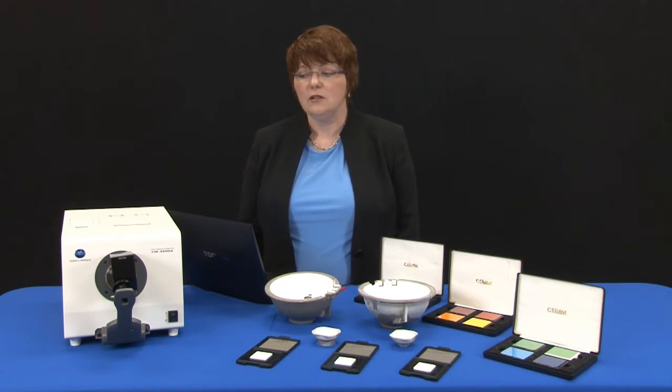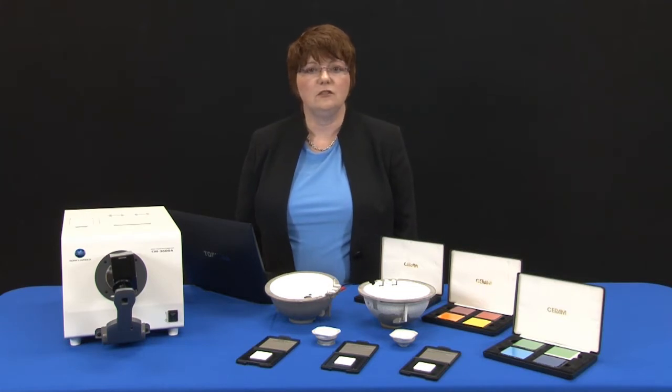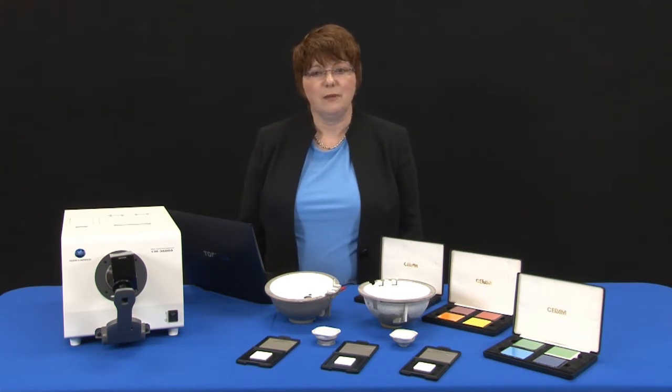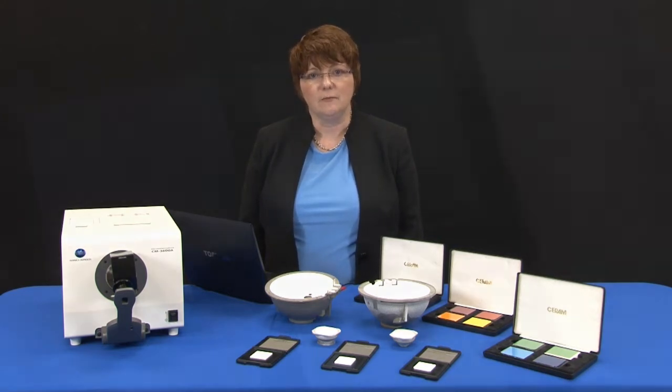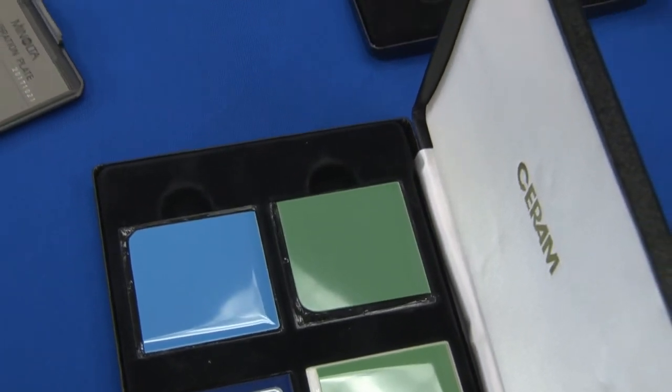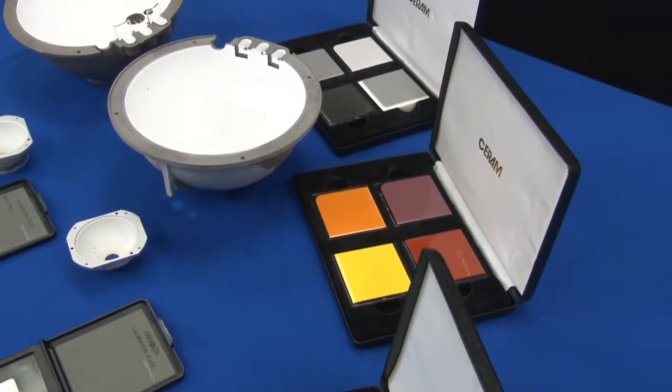To maintain your instrument properly and get reliable readings, you need to have annual and daily calibration. Calibration allows you to set a baseline for your instrument and be sure that it is maintained over time. Both daily instrument calibration and annual calibration are important to maintaining consistent and reliable readings.